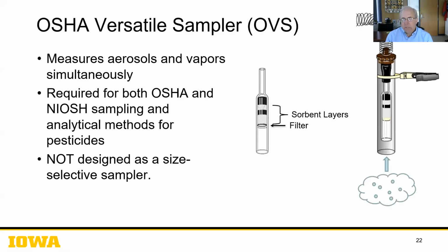When actually used, it's encased in a plastic cowl like this, and worn up near the lapel to capture both the vapors and the droplets. So then you see it points downward. So there's issues there in terms of pulling in an inhalable type of particle.